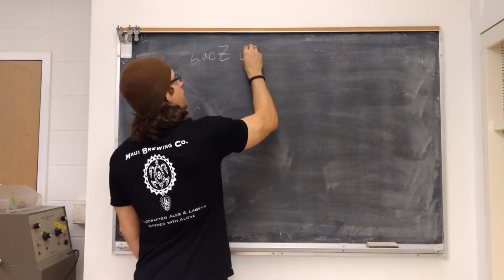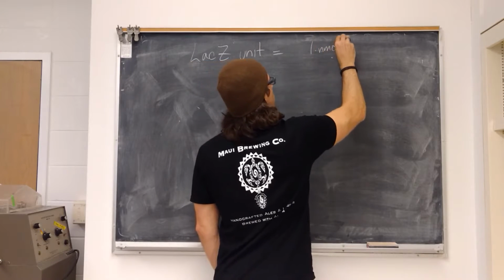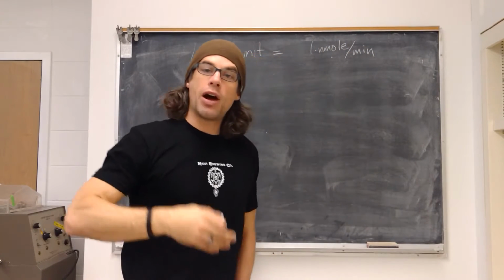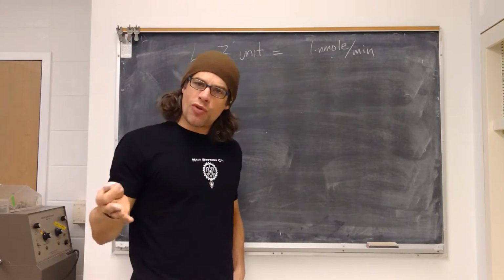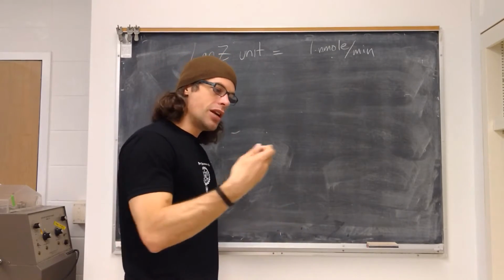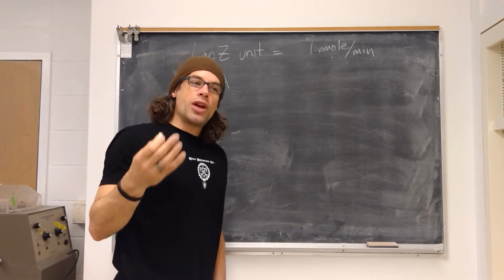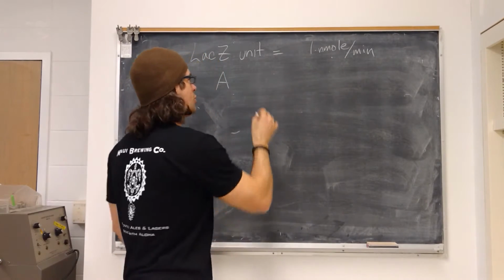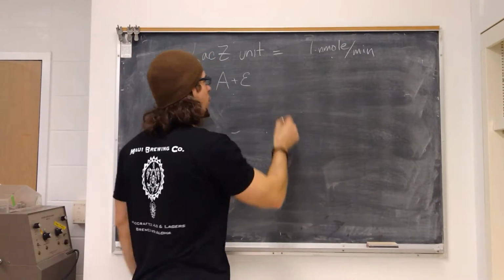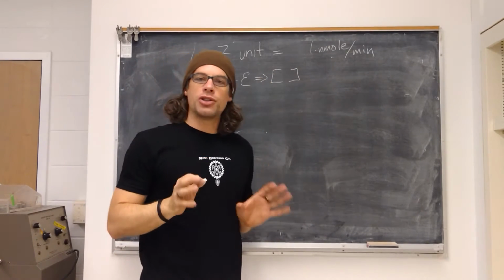So, one nanomole per minute. Now, how do we get that value? Well, it's easy when we go from our ONPG assays, which is exactly what we're determining. From our ONPG assays, we did an absorbance reading. It gives you some sort of absorbance, right? You then have an extinction coefficient. So when you put those two things together, okay, obviously you don't just add them together, I'm just indicating you put them together, you can achieve a concentration.